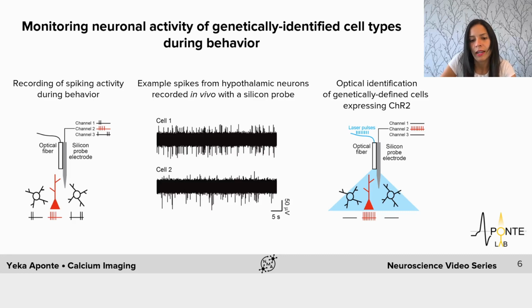However, extracellular electrophysiology is more challenging to perform in a cell type-specific fashion and over time, particularly for excitatory neurons in circuits with local recurrent connections, in which photostimulation triggers short-latency spikes not only in the channelrhodopsin-positive neurons, but also in downstream neurons. And that becomes a challenge when it comes to the identification and analysis of channelrhodopsin-positive neurons. Also, in order to record from a large number of neurons, high-density electrodes such as silicon probes are needed.